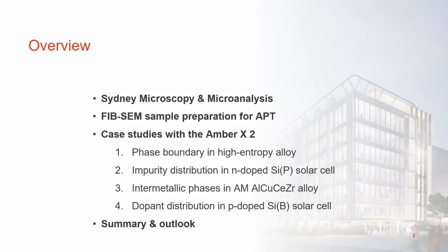As an overview, I would like to begin by introducing Sydney Microscopy and Microanalysis, followed by the requirements around atom probe sample preparation using FIB-SEM tools. After this, I want to show 4 different case studies that we have completed with the AMBER X. Those will focus around the targeting of phase boundaries in a high entropy alloy, targeting intermetallic particles in an additively manufactured aluminium alloy, as well as studying impurity and dopant distributions in different solar cells. To conclude, I want to give a brief summary and a short outlook.